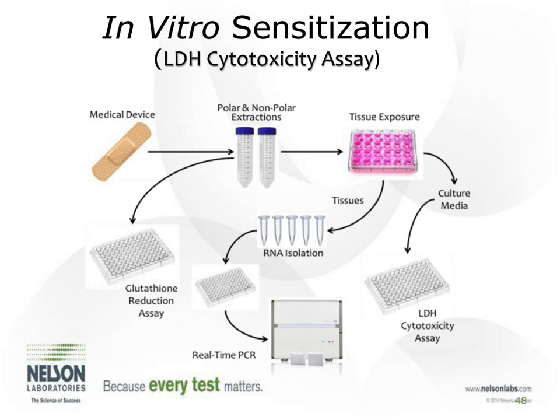going forward. So in summation of in vitro irritation and sensitization, in vitro irritation can be used right now in Europe for medical devices. We're very close to being able to prove, in my opinion, a good correlation between the animal test and the in vitro test. Sensitization is a little farther out, but it has the biggest benefit.